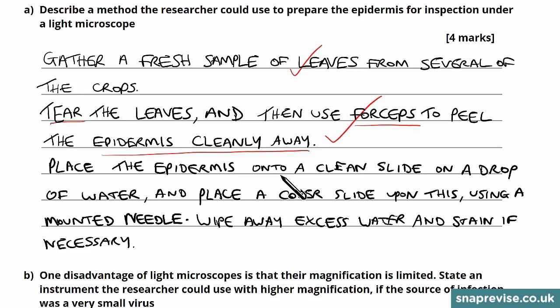We then place the epidermis onto a clean slide, onto a drop of water, and then you place the cover slide upon this using a mounted needle. Again, this is all about what we talked about in implementation. We use forceps, mounted needles, and also gloves, which I haven't mentioned here, to reduce the contamination. You don't need to go into why we do this because it's just a describe-the-method question. And then I put at the end, wipe away any excess water and stain if necessary.